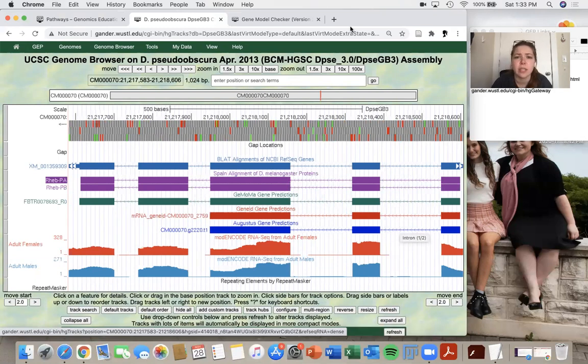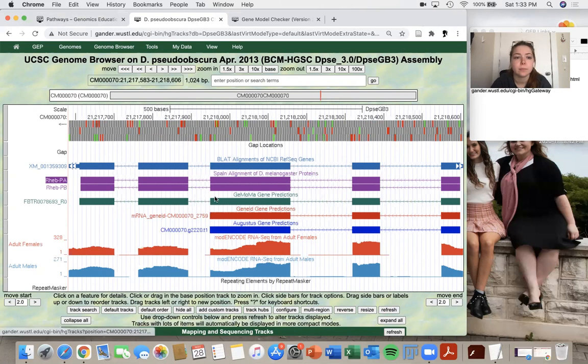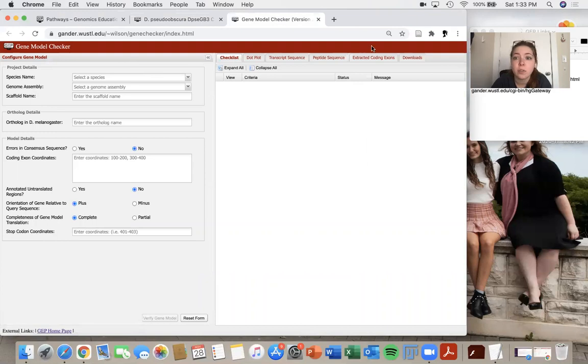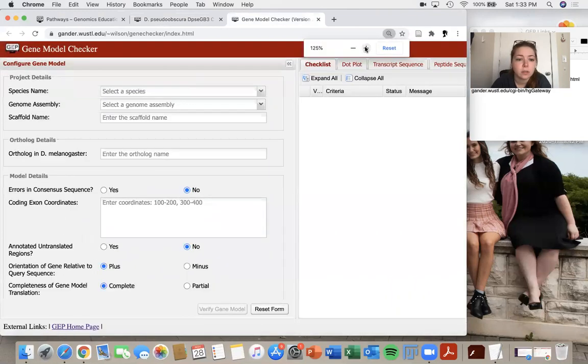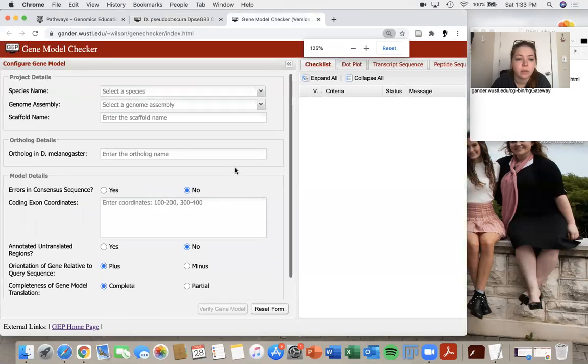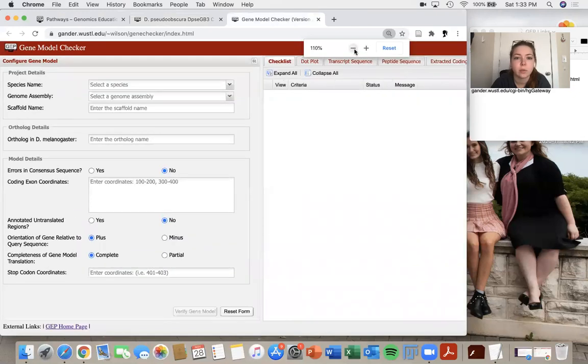Now I'm going to take you to the gene model checker. And I will zoom in really quickly for you guys so that we can really see what's going on over here.